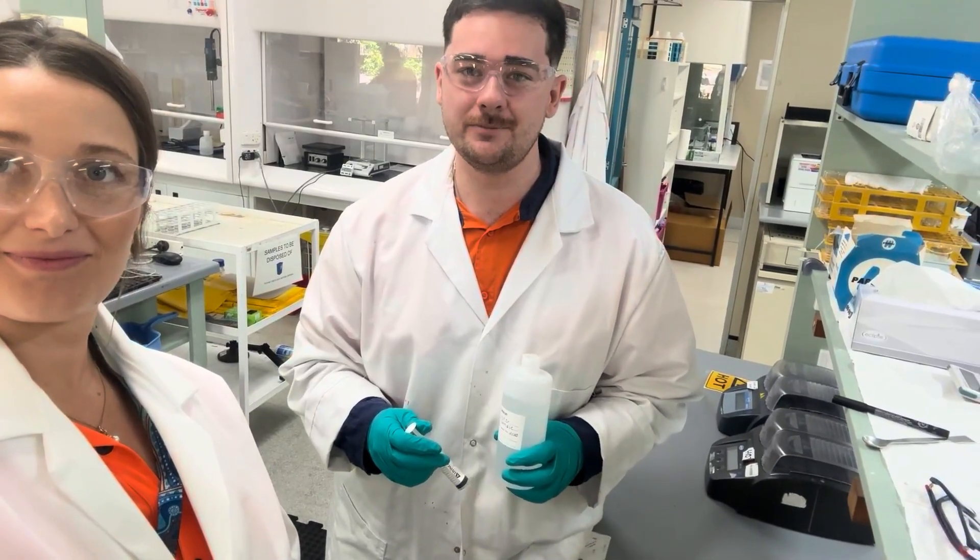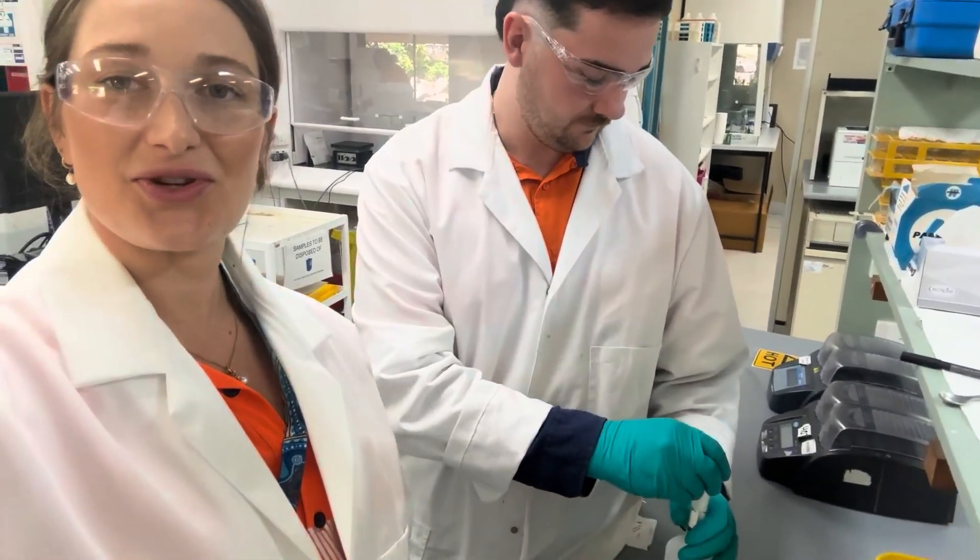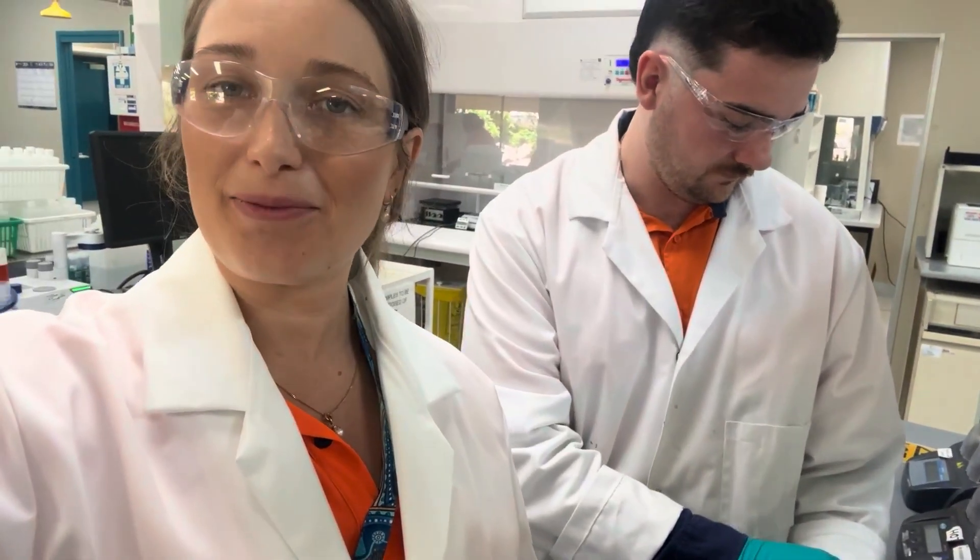So I'll just be doing a sub-sample for a metals test later on. Thanks for that, Jordan. All right, now I'm off to the microbiology lab.